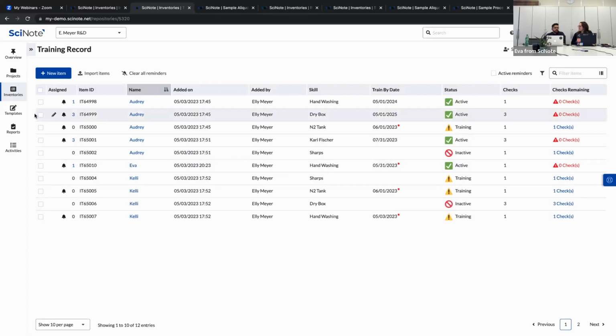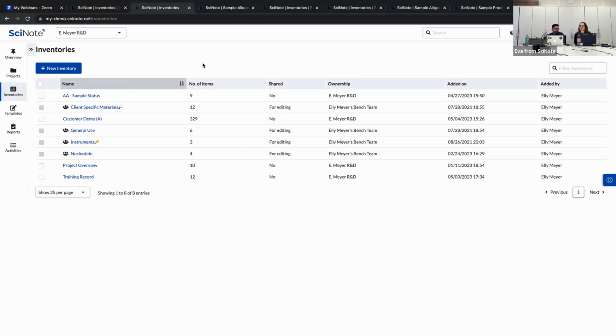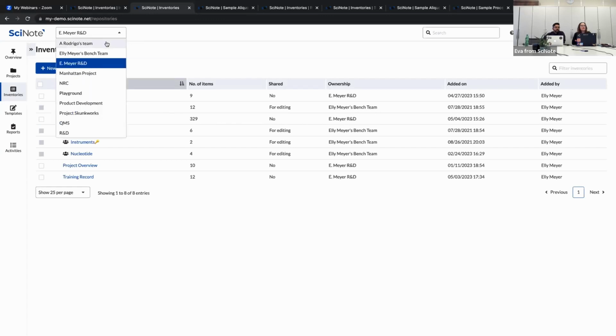All right. I think that's all the information that I wanted to cover in terms of use cases. So we can move on to questions, Eva. So we have a short one, and it's what sort of column is in the SOW hours remaining? Great question. So let's jump over to that inventory.